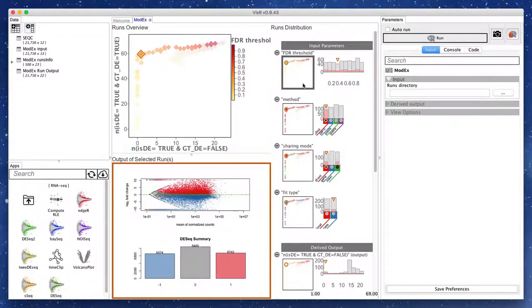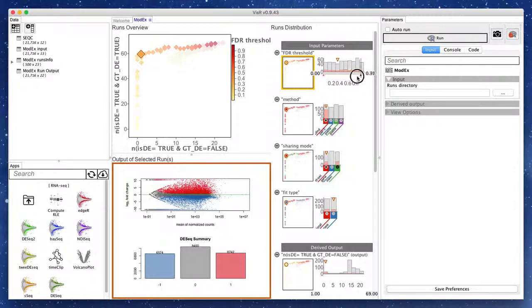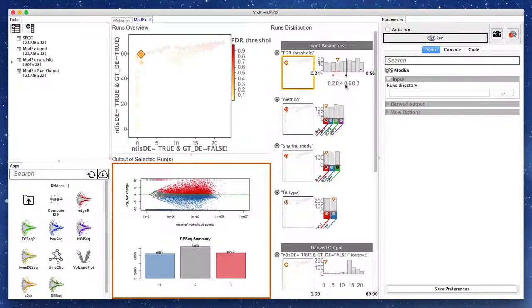Finally, we see that the FDR threshold parameter is highly correlated with the placement of runs along the Pareto front. Selecting the FDR threshold around 0.4 seems to provide a reasonable trade-off between a high true positive rate and a low false positive rate.